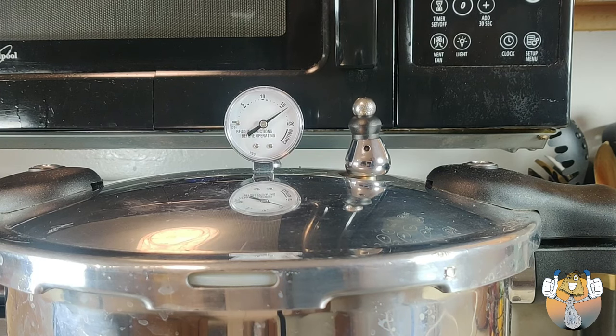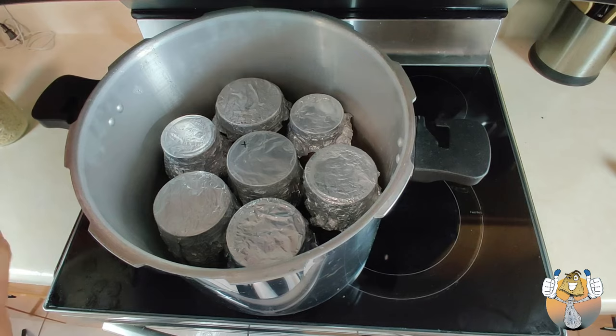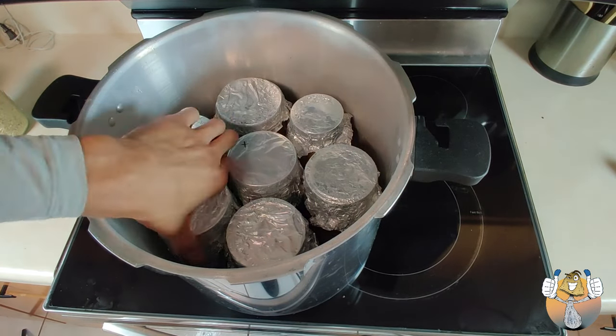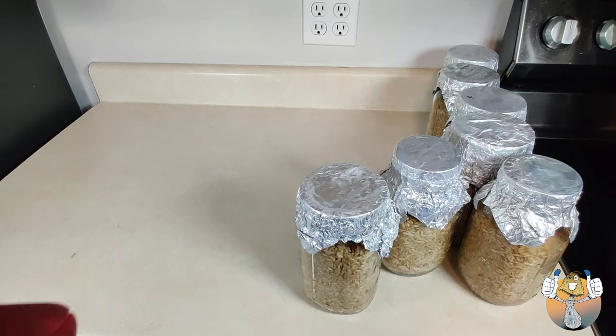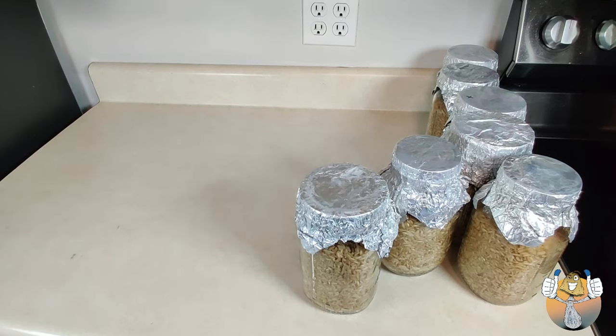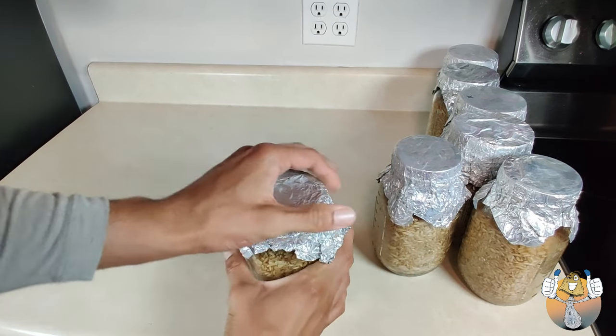All right, so now once your weight gets to wobbling like this, we set our 90-minute timer. And we kick back and wait and wait some more. Once our 90 minutes is up, we then depressurize our pressure cooker. And honestly, I did not really let this sit for too much longer. We want to go ahead and shake our rice right away so that it's not clumped together.